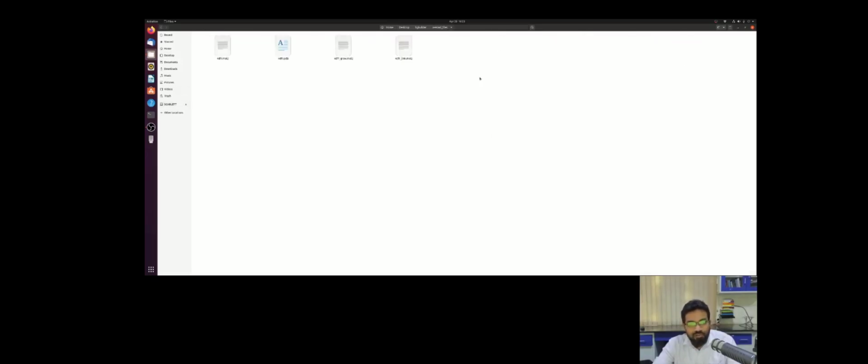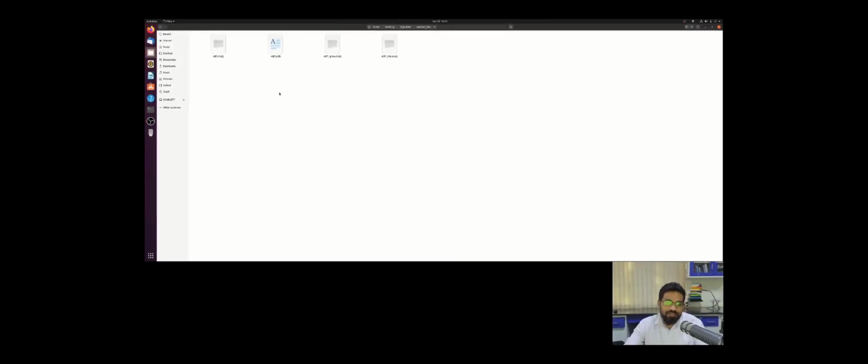These are the folders present inside the LigBuilder folder: bin, forbidden.mdb, fragment.mdb, grow, link, Mozilla installer, needed files, parameter, pocket, process, toxicity.mdb. Inside needed files, I kept all the files needed for this exercise. 4dfr.pdb is the protein molecule, and 4dfr.mol2 is the ligand molecule. It's actually a complex: 4dfr is a complex made between the protein and ligand molecule.